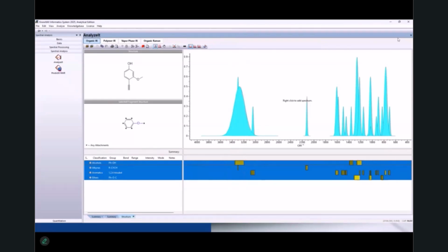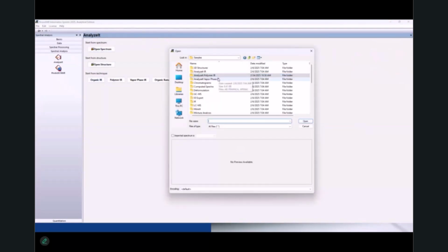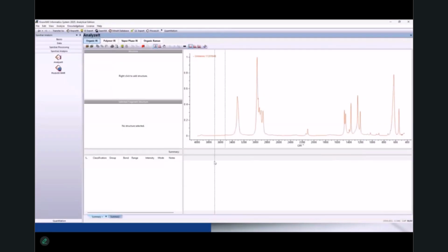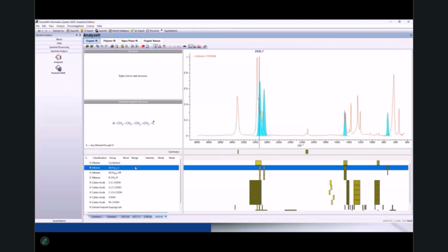And so let's go back and try with a spectrum. Let's do an unknown spectrum. So I'm going to go to my samples and try an unknown here. Okay. So here you use the find peak option to suggest a peak, and you can correlate it. Go to the next one. Perfect. So this one looks like a pretty good match. And so I'll add it to my summary. And then these ones, let's see. That one's not too bad.